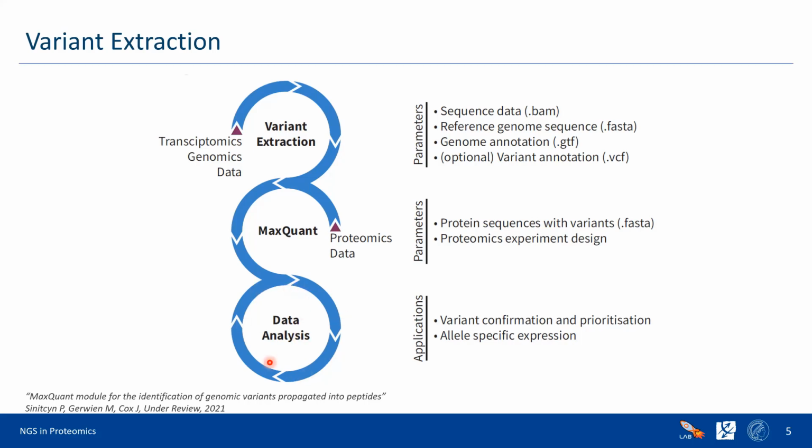And as you see, this data analysis can go forever. It's basically while true, but there's a broad application for such type of data, and I would like to highlight a few of them. For example, variant confirmation and prioritization, which can be very powerful. But from another point of view, there are truly biological questions.